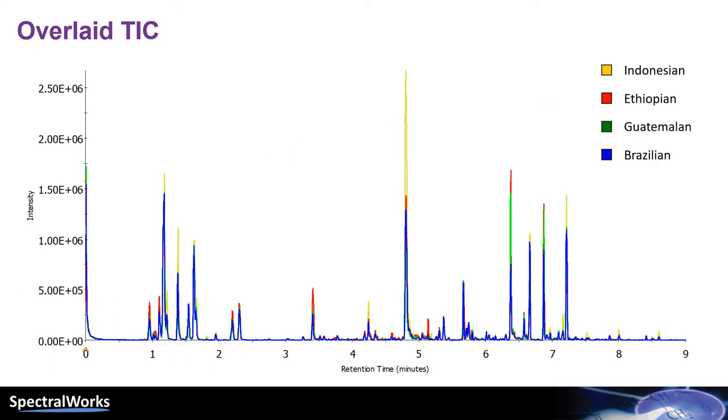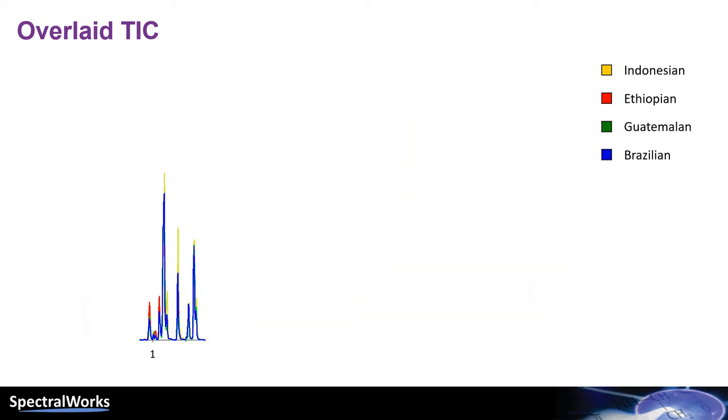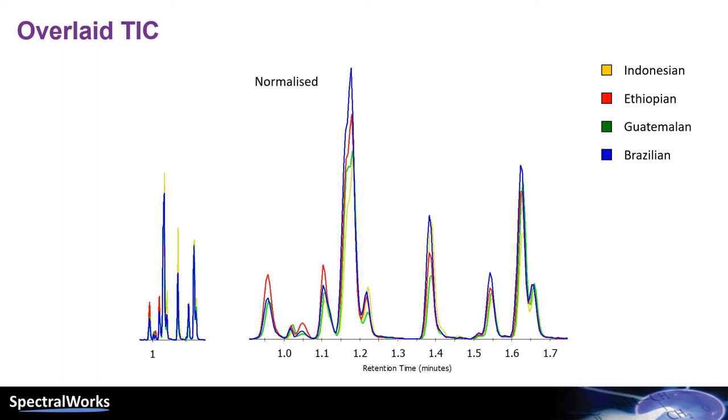When we overlay the absolute TICs, again we can clearly see how similar these files are. On further inspection, if we take the first section of data and zoom in around 50 seconds or so on the normalised traces, we can see we get a better indication on how subtly different these files are.